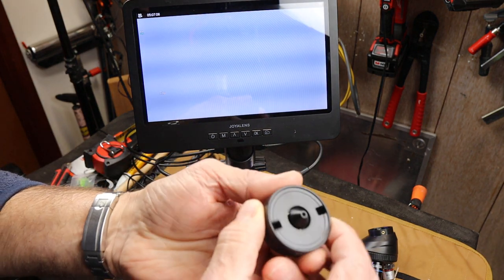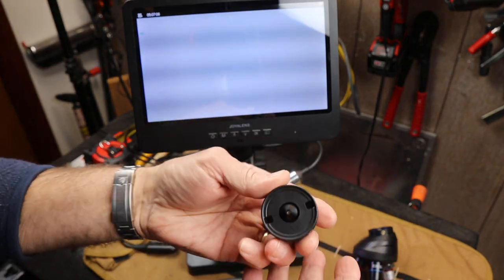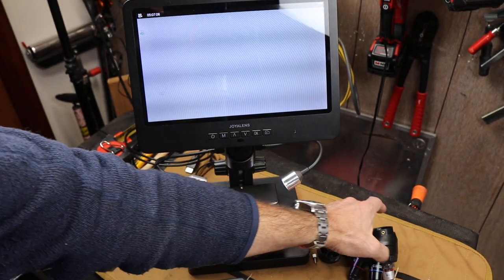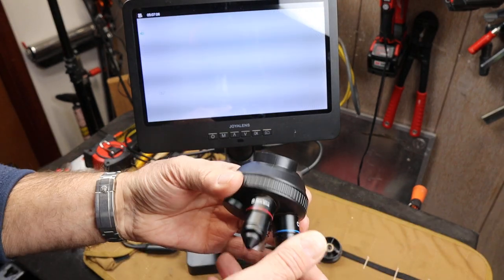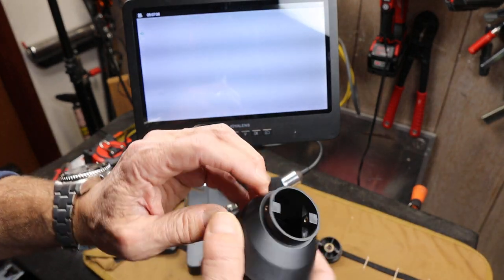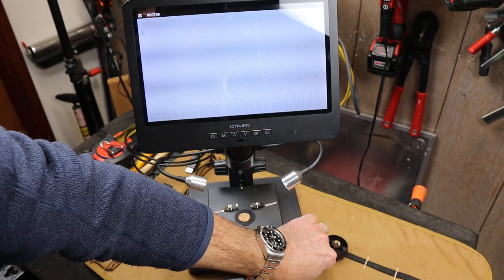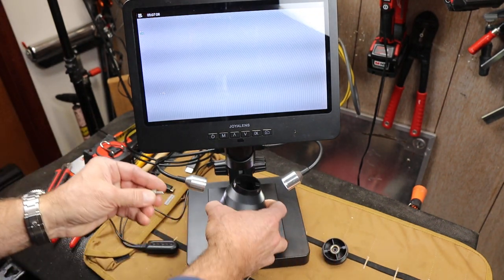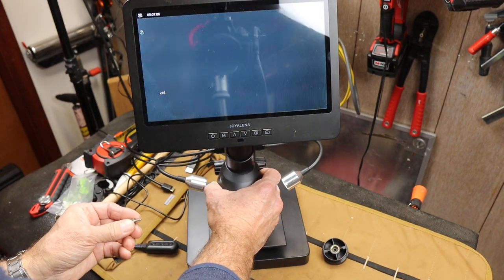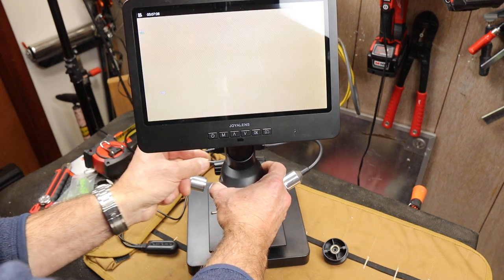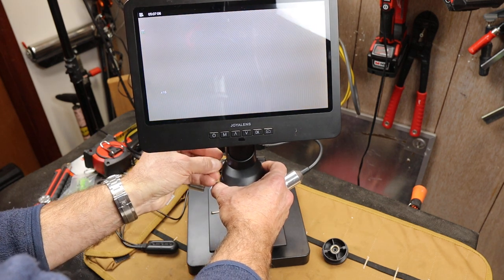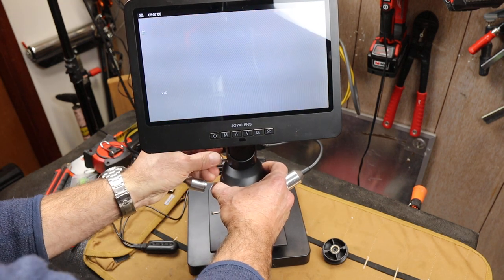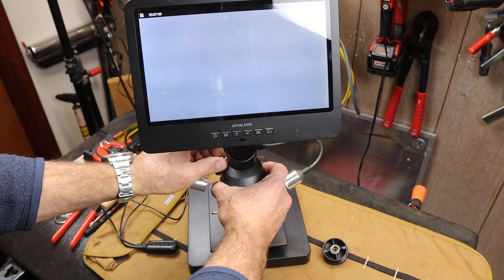But there is the base lens, it's a very small, very light lens, so I can throw this on, and you can see there are two set screws that just slide right in, it aligns, and I can put the screws in. It's that fast.